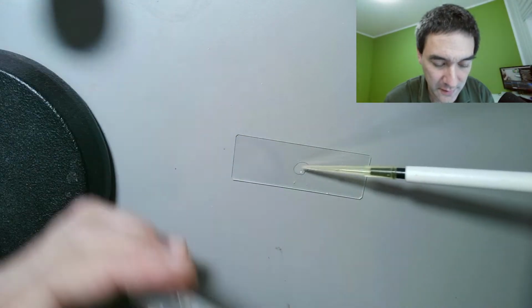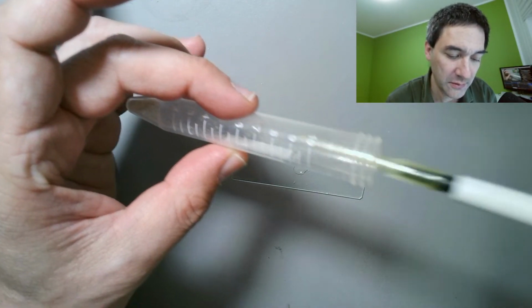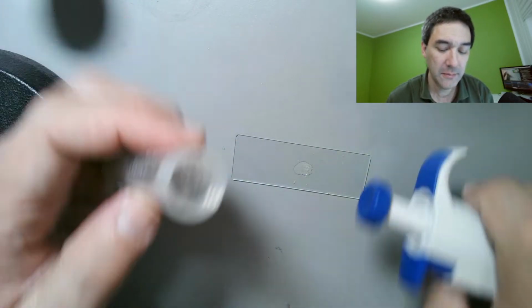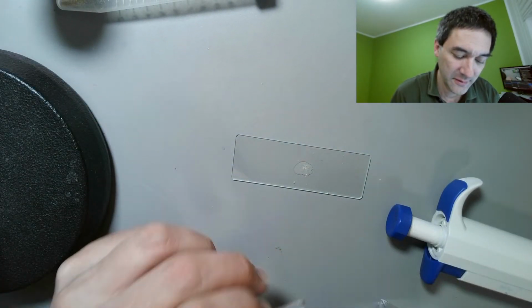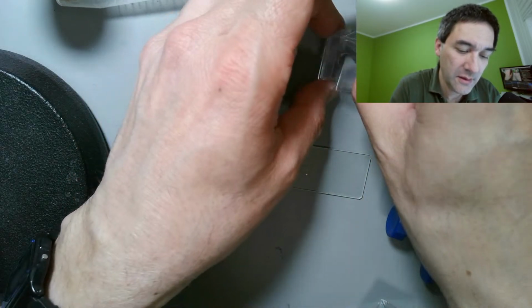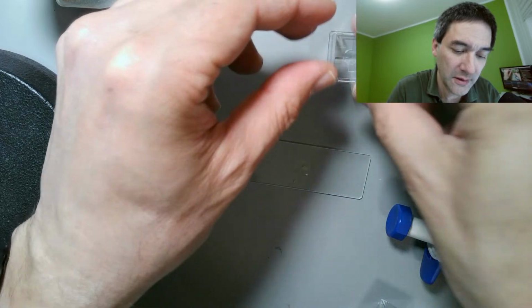Which it was not. But that's also sometimes interesting to see. And then I lost my cover glasses. And here we go.